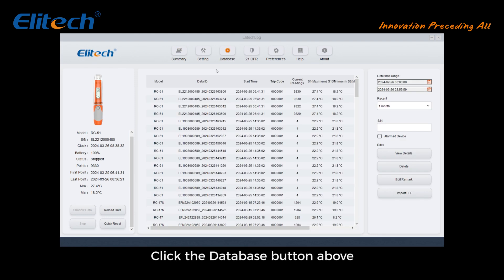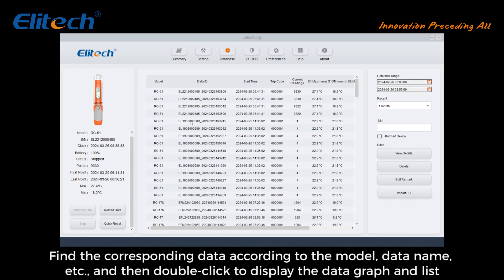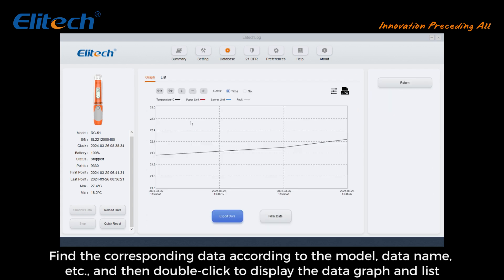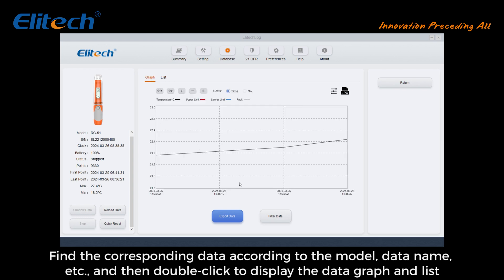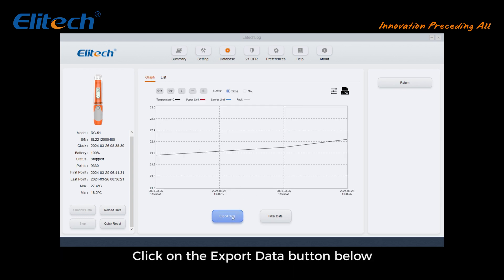If you need to view previously exported data, click the Database button above. Find the corresponding data according to the model, data name, etc., then double-click to display the data graph and list. Click the Export Data button below to export.